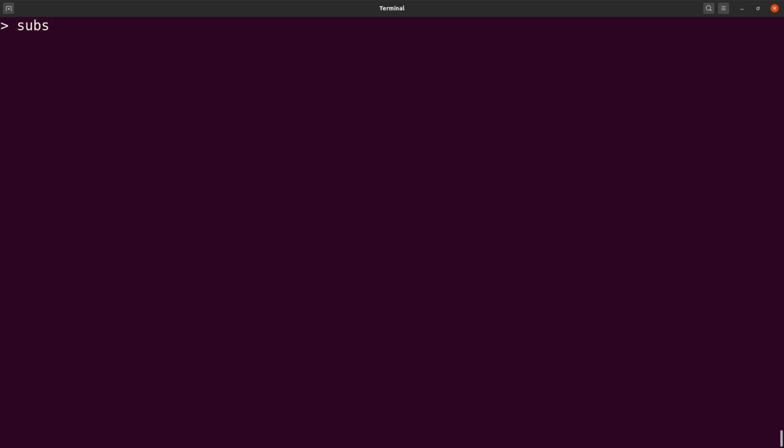So we say subset. I'm starting with the transcript. So I'll say subset underscore transcripts. And then I'll say subset again, and I'll say D transcripts. Okay, this is our table of interest, and I'll say where D transcripts has the column, which is qvalue, less than 0.05. That is what this command basically means. So let's run this command.